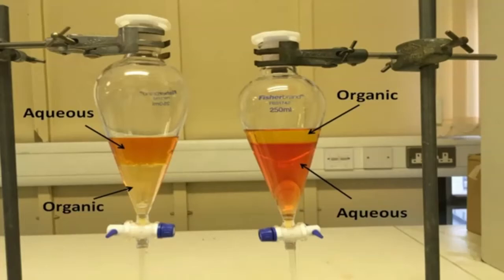But on the left-hand separating funnel, the orange aqueous phase forms the top layer and the bottom layer is the yellow organic phase. This is because an organic solvent called dichloromethane, DCM, was added to water, and DCM has a density of 1.3 grams per centimetre cubed. Hence DCM is more dense than water, so the bottom layer on the left-hand separating funnel is the organic phase.